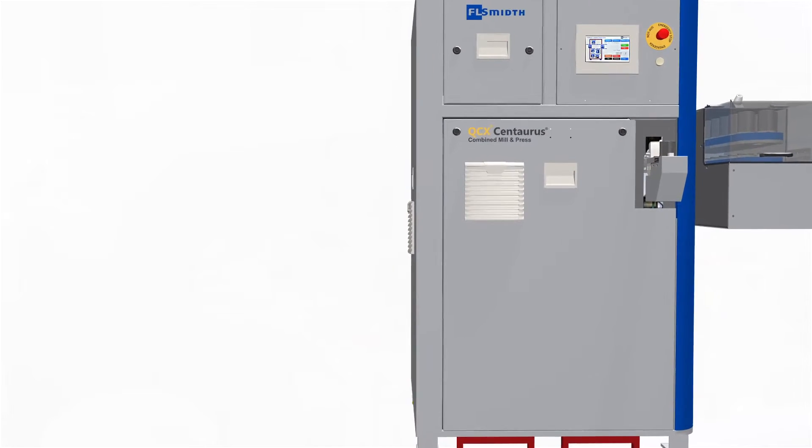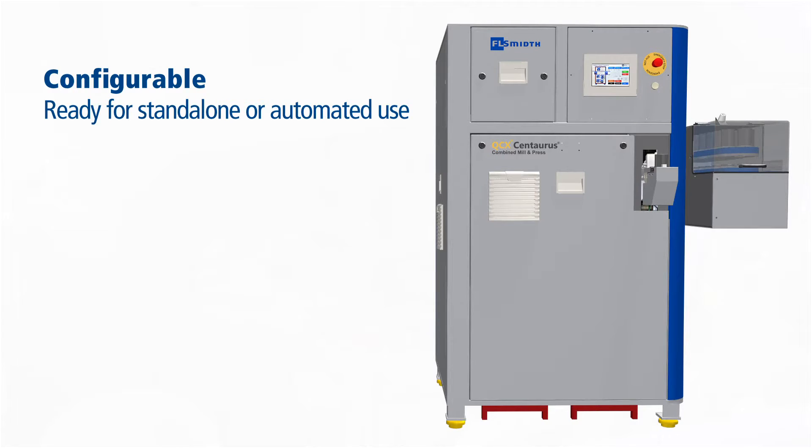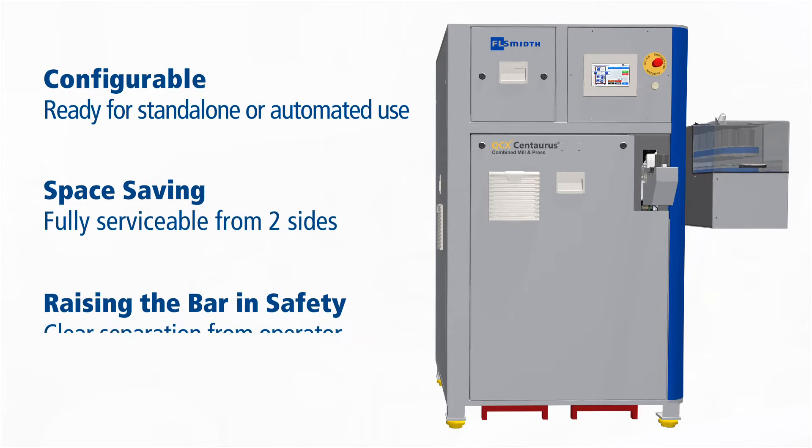The Centaurus has a number of features that bring tangible benefits for performing state-of-the-art powder sample preparation for XRF and XRD. The Centaurus can use various flexible setups. The modular fabric and the elaborated arrangement inside the Centaurus opens up the possibility for uncompromising laboratory design, combining user-friendliness, safety, and efficiency.